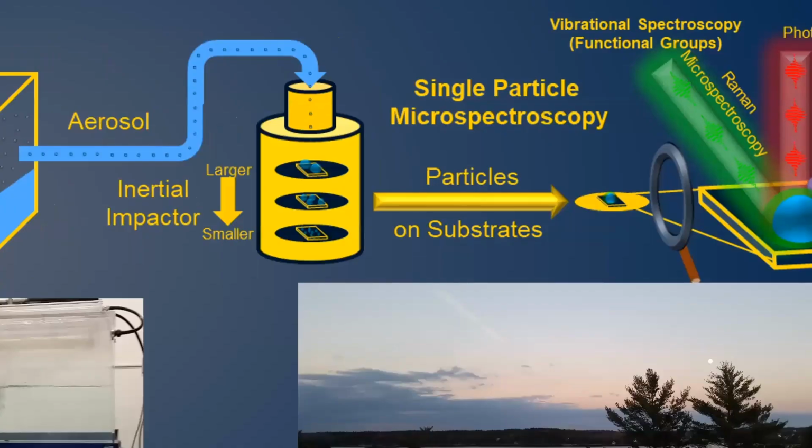So that established that we could look at this with controlled samples in the lab, but what happens when we start working with more complex particles? As part of an NSF-funded project with collaborators Patty Matrai at Bigelow Ocean Sciences Lab, Carrie Pratt here at Michigan, and Amanda Grannas at Villanova, we collected particles with a marine aerosol reference tank using fresh seawater from the Gulf of Maine that you can see in the picture here in the lower right.